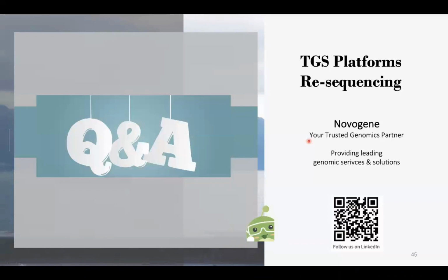All right, lastly, I'm going to wrap it up by addressing some of the frequently asked questions. I see the questions in the QA module. Like, what mapping rates would allow variant calling? Could you please list the potential causes of low mapping rates? We highly recommend mapping rates ranging from 70% to 90% for variant identification based on our experience.